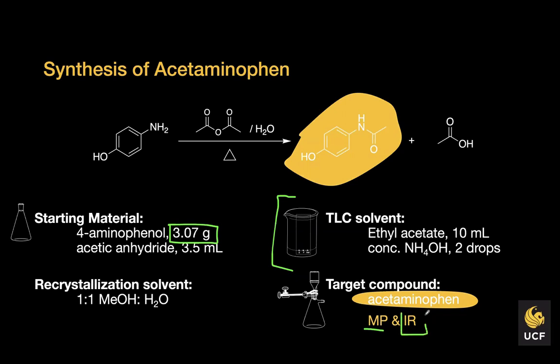And then the IR helps us identify the functional groups that are present and basically characterize the product, right? Can we identify the peak or the wave number where the benzene ring occurs, where the alcohol occurs? Could we see a peak for the carbonyl oxygen, right?